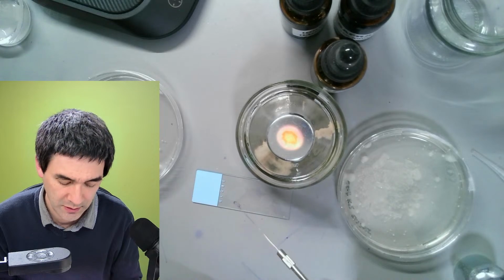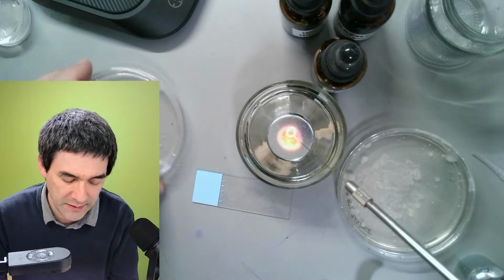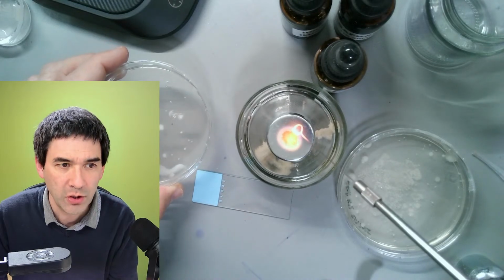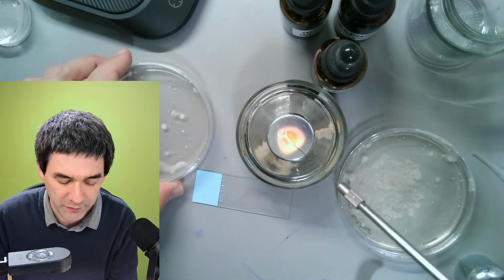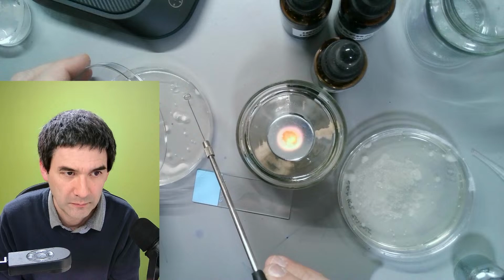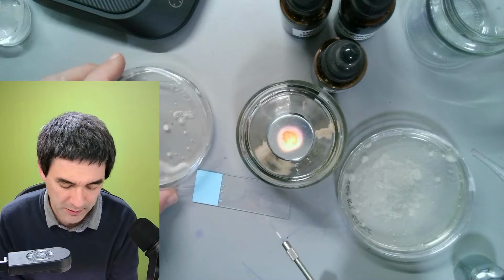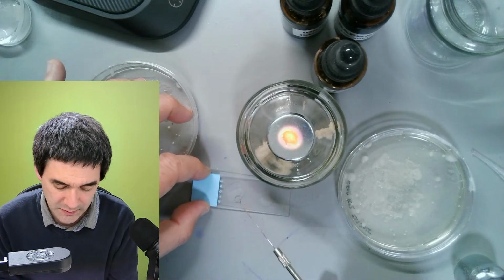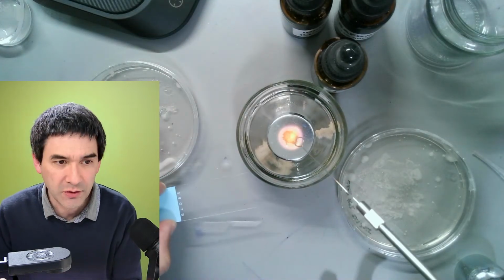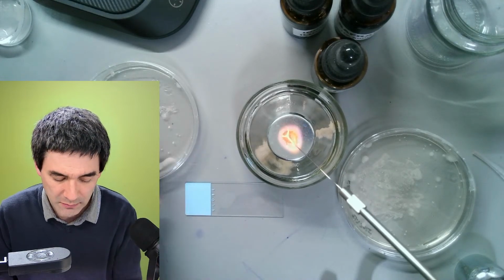Not a lot. And when you're finished with that, you just go back here again. This is very soft. See, I was not even able to properly pick it up because it was so soft. Maybe add a little bit more. You see, this is actually the whole colony. I couldn't even properly pick it up. So let me hold it over. Yep, there is something. Sometimes if you don't see it, you want to hold it over a dark surface. So that's number one, an unknown one.